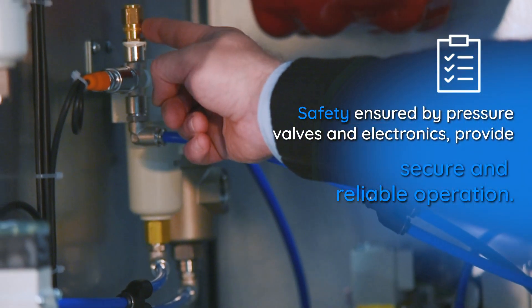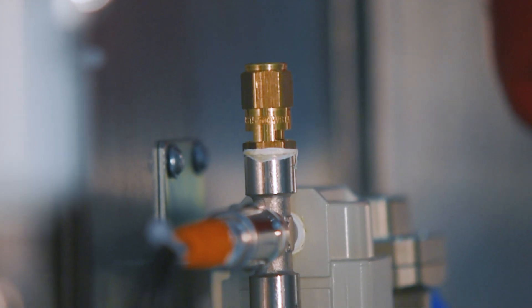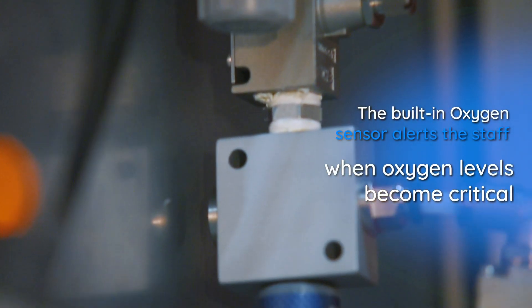Safety ensured by pressure valves and electronics provide secure and reliable operation. The built-in oxygen sensor alerts the staff when oxygen levels become critical.